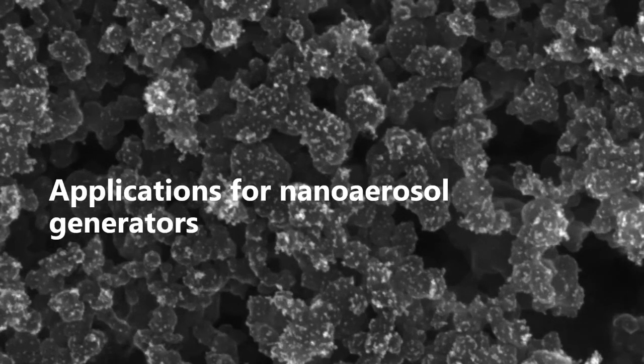So moving on from there, applications of nano-aerosol generators. I'm going to highlight a few case studies of basically aerosol science, or basically people using spark generators to study properties of small particles in the gas, mainly related to how they interact with people.